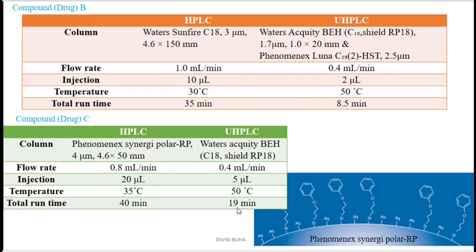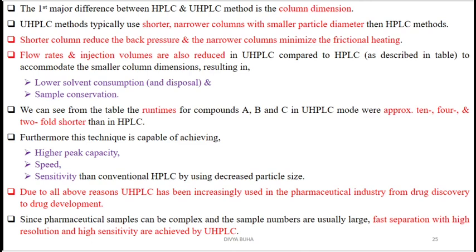Right. So if we compare all of the parameters which are set inside the instrument, there is a huge variation between conventional HPLC and UHPLC. Through various things we can see that UHPLC is always superior as compared to the conventional HPLC technique.